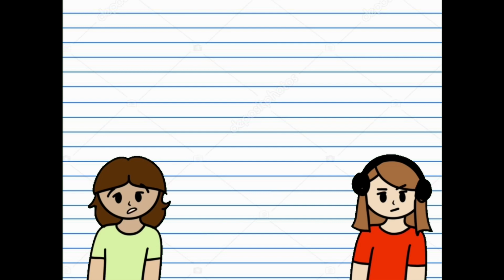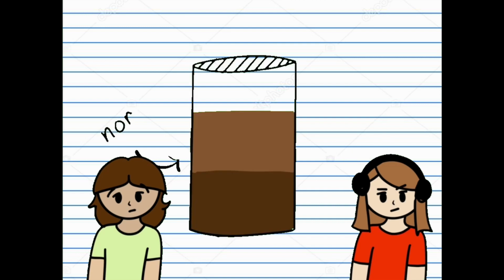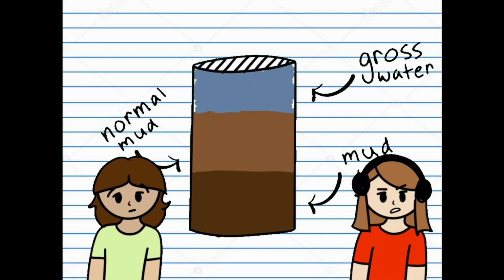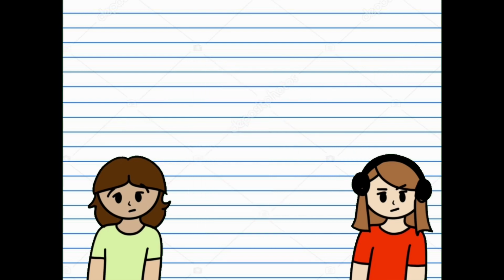Now, let's talk about how a Winogradsky column works and how you make them. First, we got clear plastic or glass containers and mud from our source locations, a source of calcium carbonate, like crushed eggshell or limestone, sulfur compounds like gypsum or egg yolk, and a carbon source. We used paper. And finally, water from the source location. We started by filling the container with mud, adding the carbon source, such as crumpled newspaper, to the top of the mud, and pouring water in to fill the container fully. And now you have your own mini ecosystem.